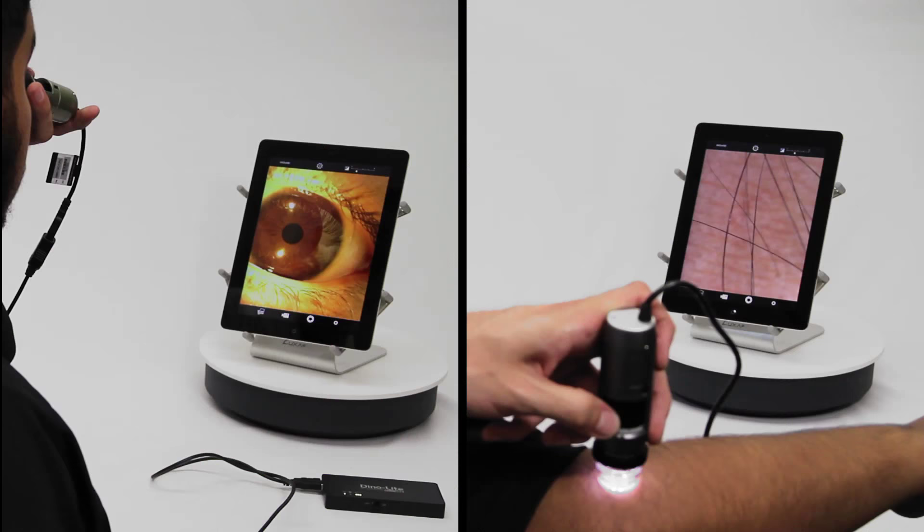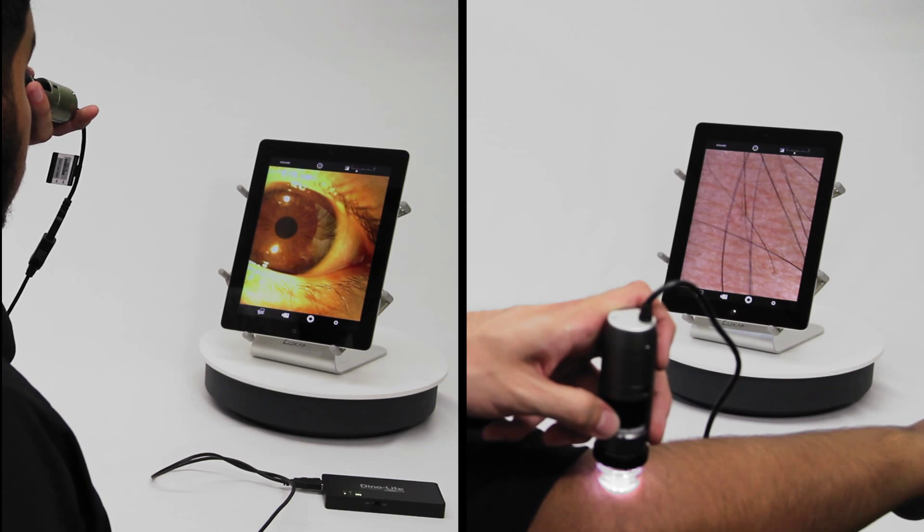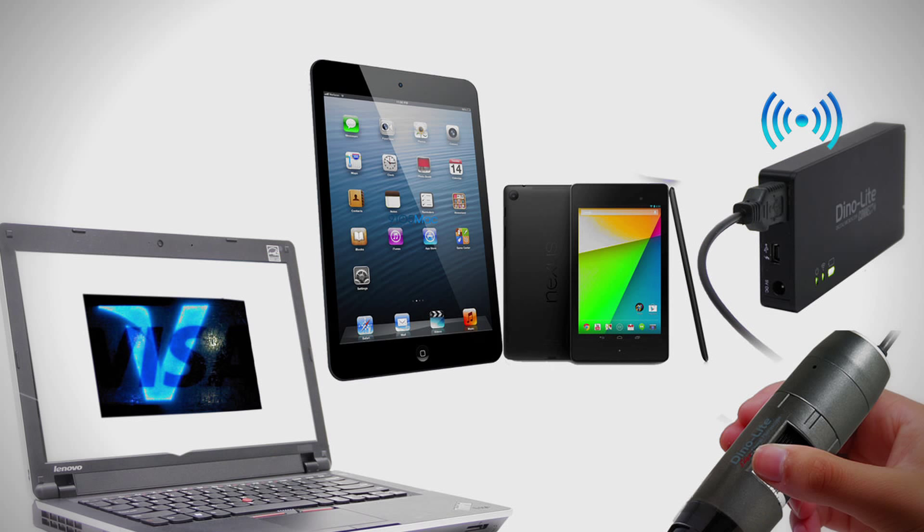The WF10 can stream with DinoLite wirelessly to Apple iPhones and iPads, compatible Android devices, and even Wi-Fi enabled computers.